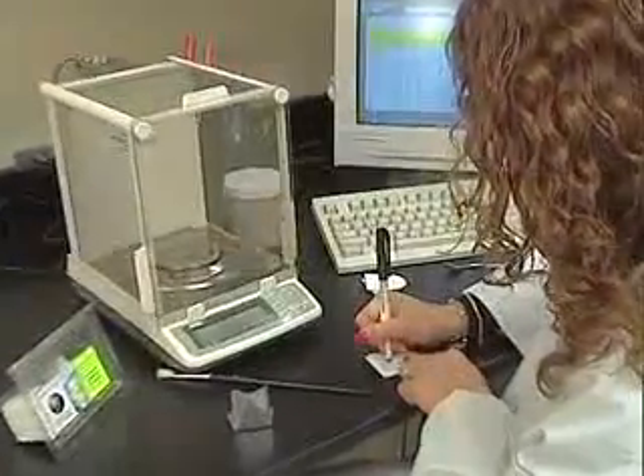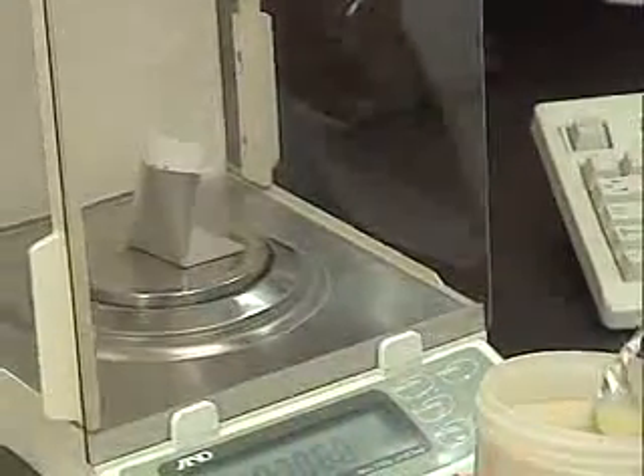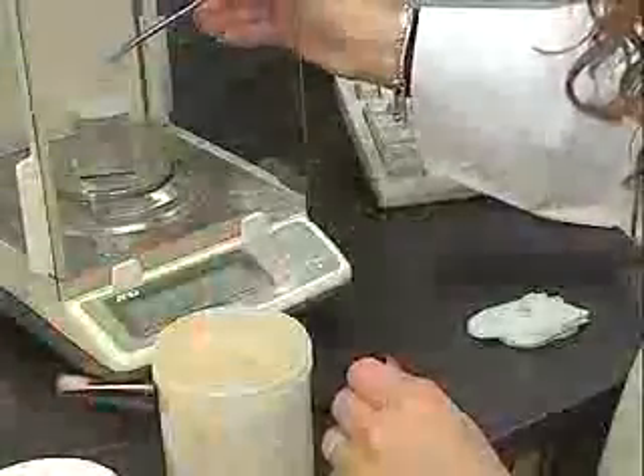Like most methods, the process begins by weighing and preparing the samples to be extracted. With the XT15, each sample is weighed into a filter bag, which is sealed to encapsulate the sample. This not only protects the sample, but also eliminates errors associated with most methods.